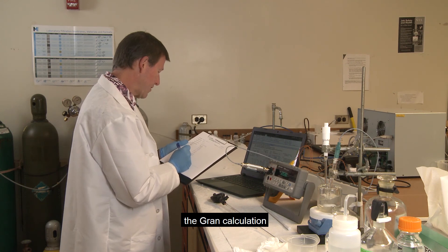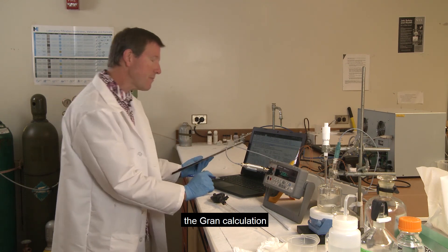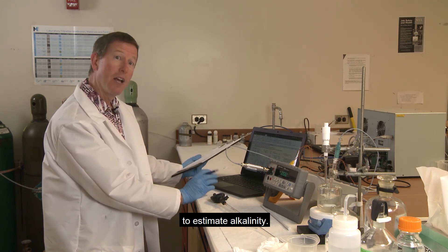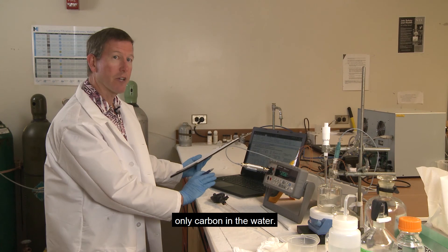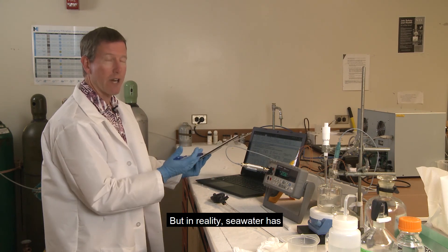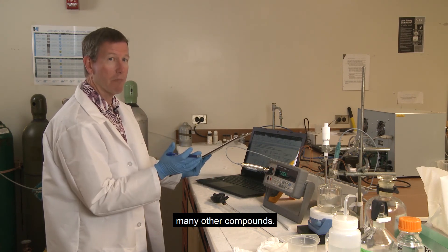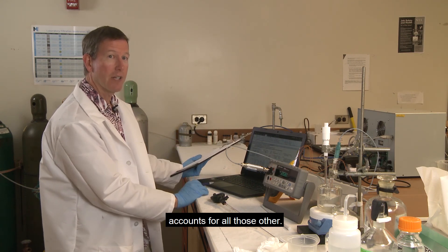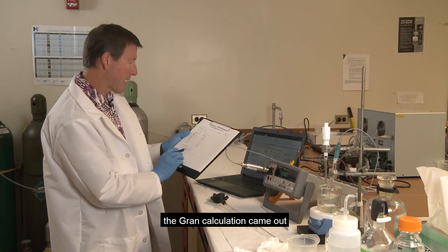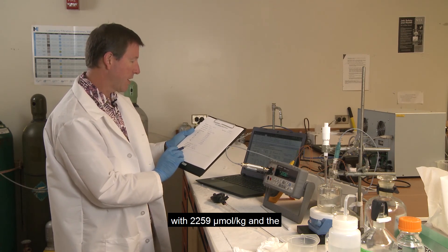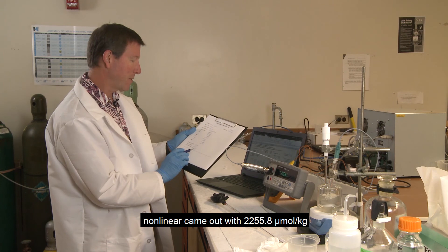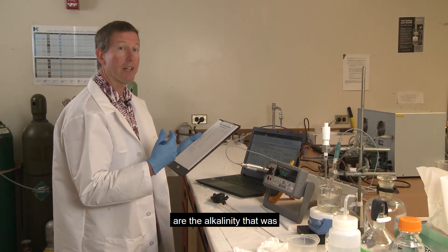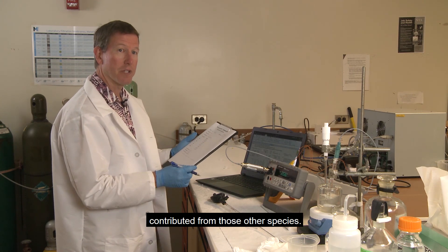So the difference is the Gran calculation does a linearized function to estimate alkalinity just based on assuming that there's only carbon in the water. But in reality, seawater has many other compounds. So the nonlinear fit accounts for all those other. And you see the difference, the Gran calculation came out with 2259. The nonlinear came out with 2255.8. The difference between those two are the alkalinity that was contributed from those other species.